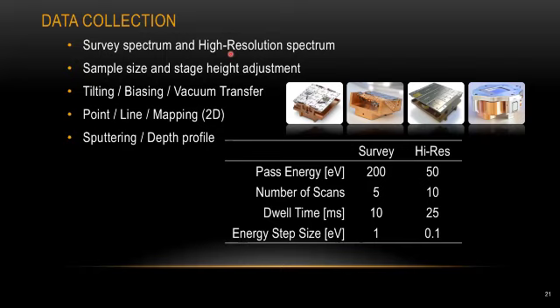And here I also mention the stage height adjustment. During the XPS measurement, we do care a lot about the height of your top sample surface. We want to make sure your sample surface is within the focal length underneath the X-ray gun. Anything out of focus from the focal length, you're going to get very different XPS signal. And that's why we definitely care about the top surface of your sample.